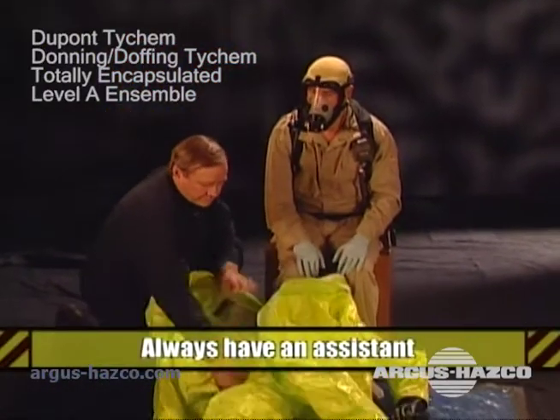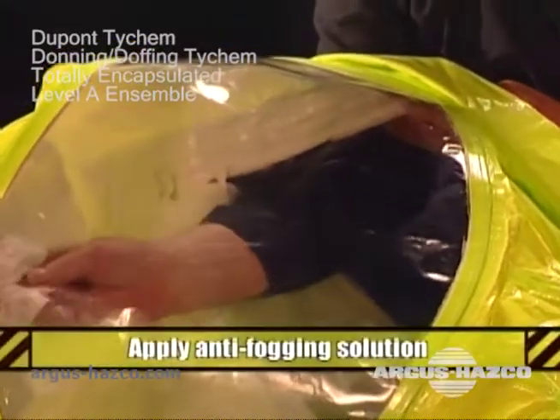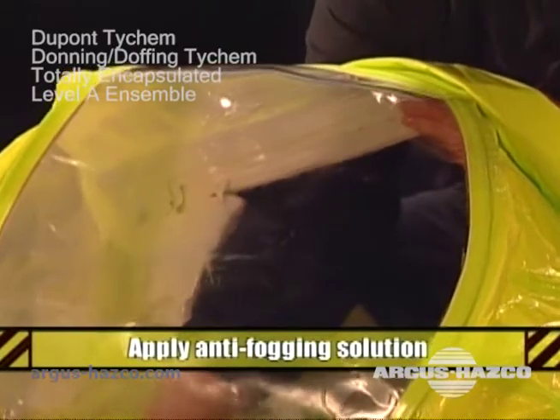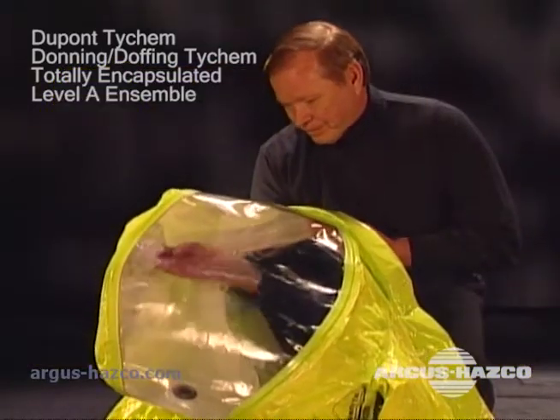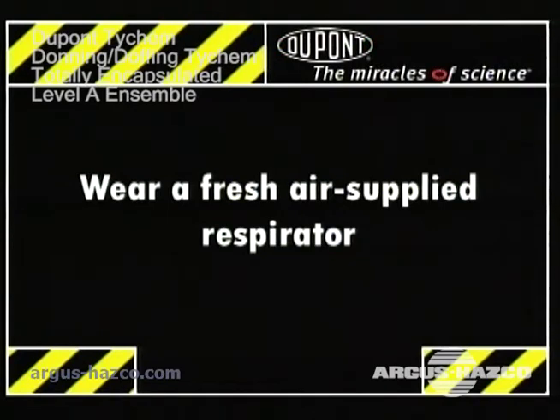You should have an assistant when donning and doffing a Level A garment. Apply anti-fogging solution to the face shield prior to donning. You must wear a fresh air supplied respirator with a totally encapsulating suit. For purposes of this demonstration, we are using an open circuit SCBA.